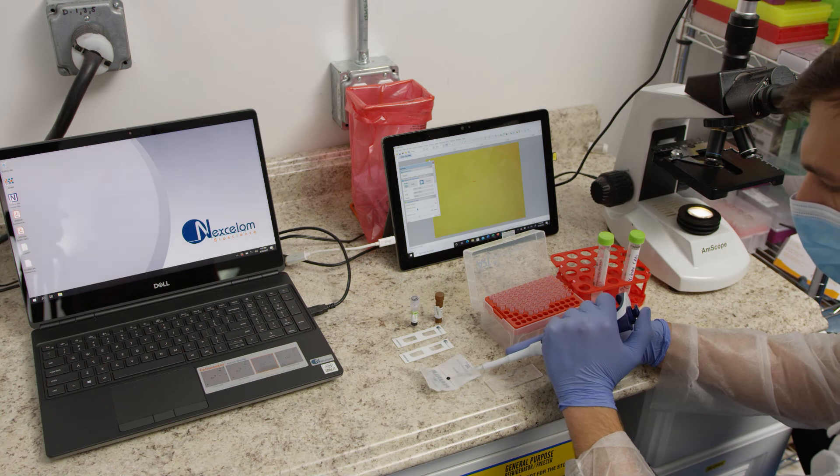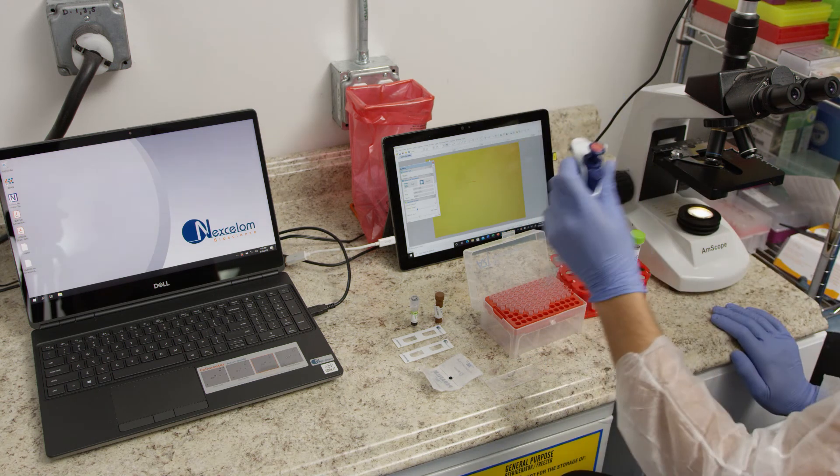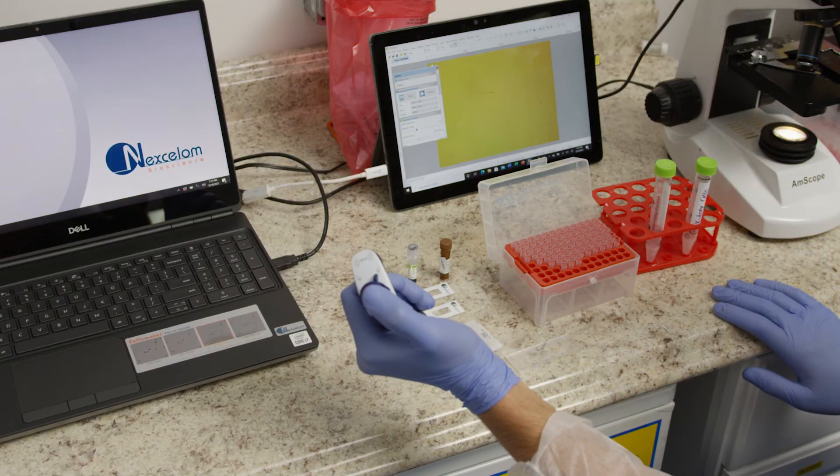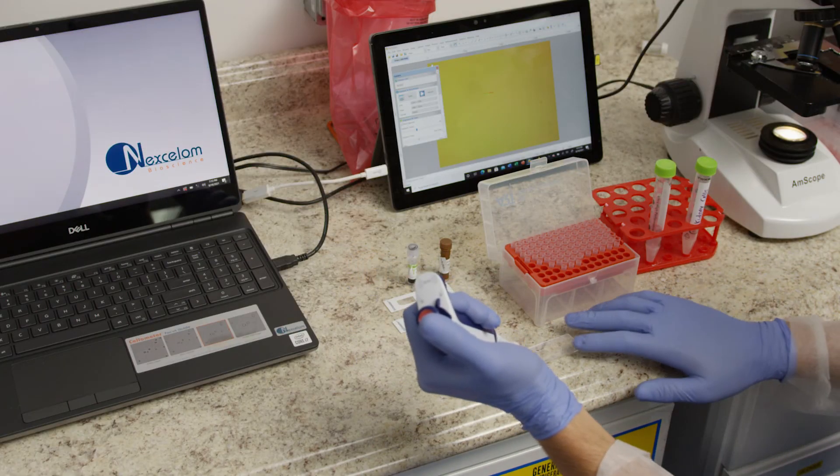For use of Trypan Blue, mix 20 microliters of Trypan Blue and 20 microliters of sample, then add 10 microliters to each side of an analysis slide for counting.